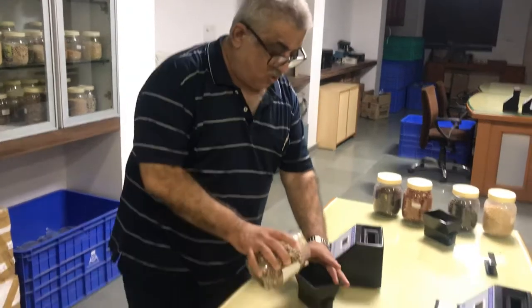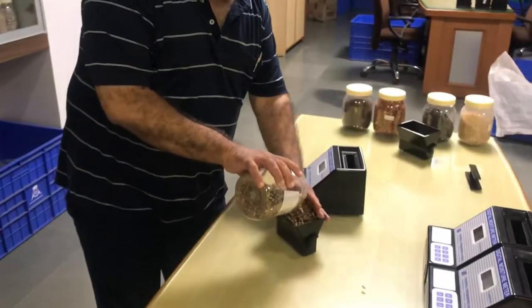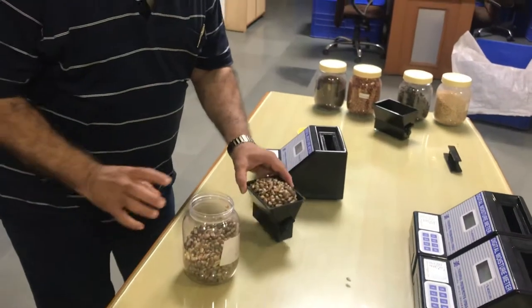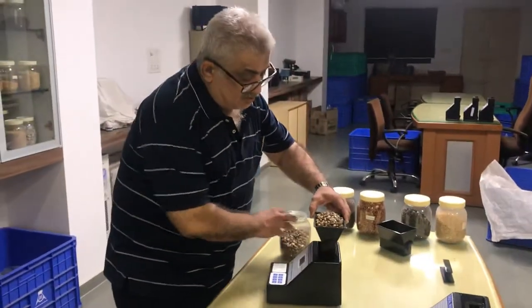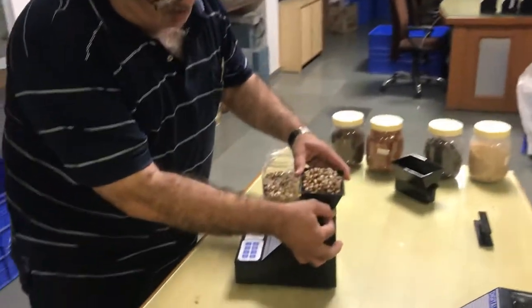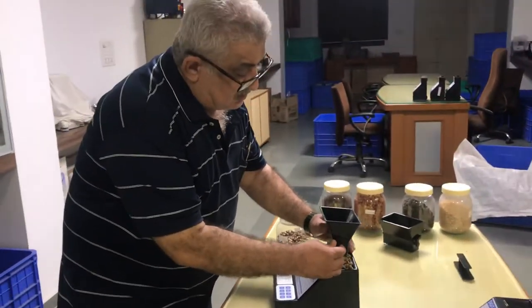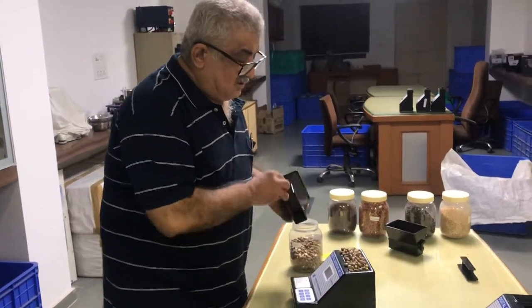You have to take the full volume of the hopper. You have to fill the Castor seed like this. Then, you have to see that the right side lever of the hopper comes down. Just drop the lever down. This will be filled with the Castor seed.